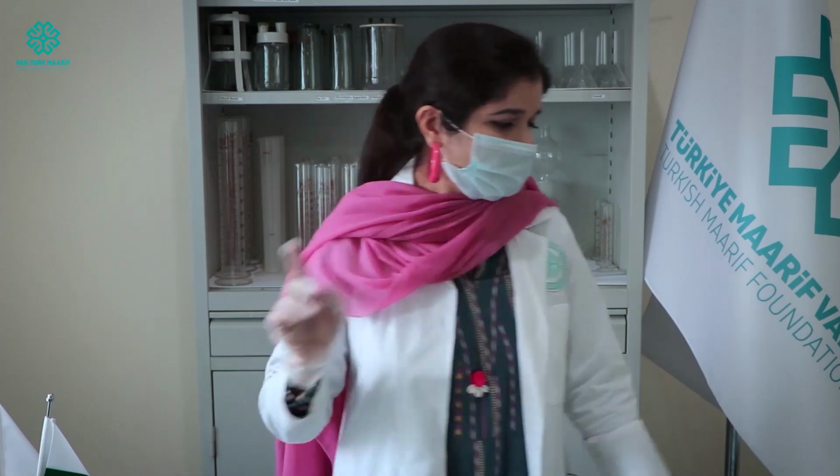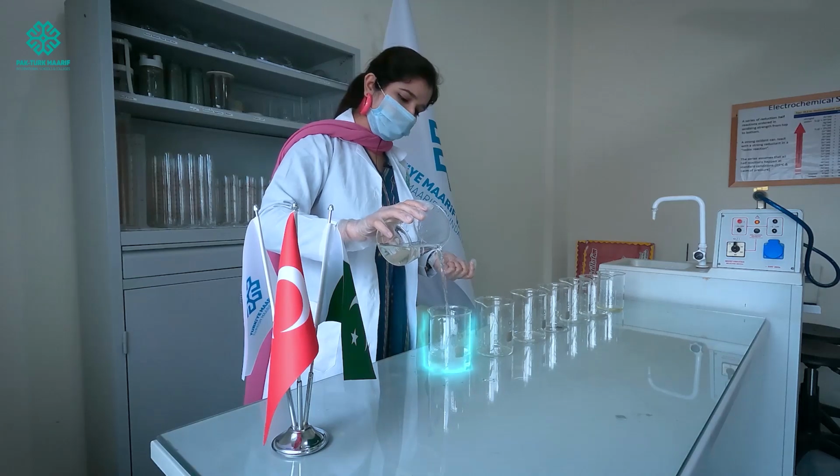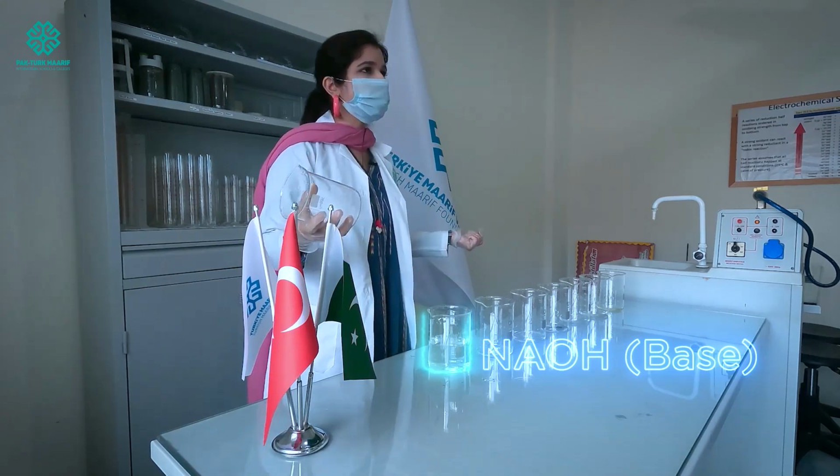So, in the first beaker, what is it? It is 20 drops of sodium hydroxide. Now what is sodium hydroxide? It is a base. Okay, so when I added the simple tap water in the sodium hydroxide, there will be no change in the color of the solution.